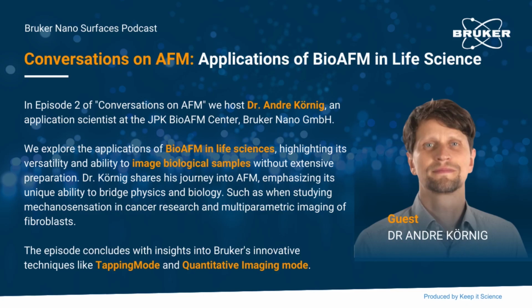And for those who are still intrigued about that mode, do you think it is most well suited for soft or sticky or highly structured samples? Or when would the QI mode be really important, and when does it make the most sense? Like what kind of samples are we talking about?